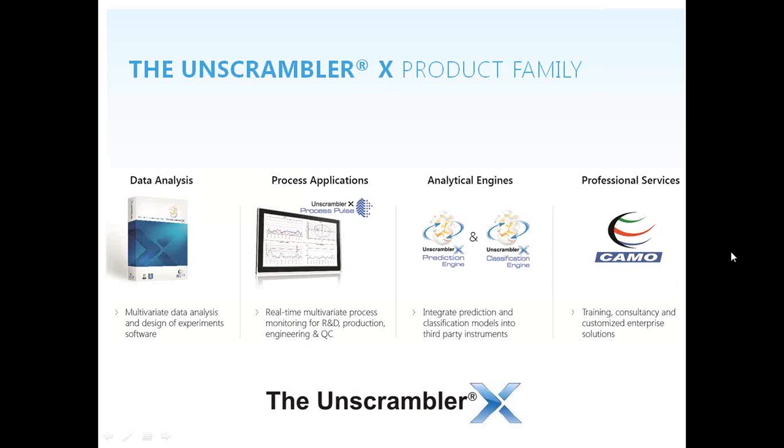Our product portfolio includes our flagship product, the Unscrambler X, for multivariate analysis and design of experiments. The Unscrambler is suitable for a wide range of data analysis tasks, such as exploratory, regression, classification, and prediction.